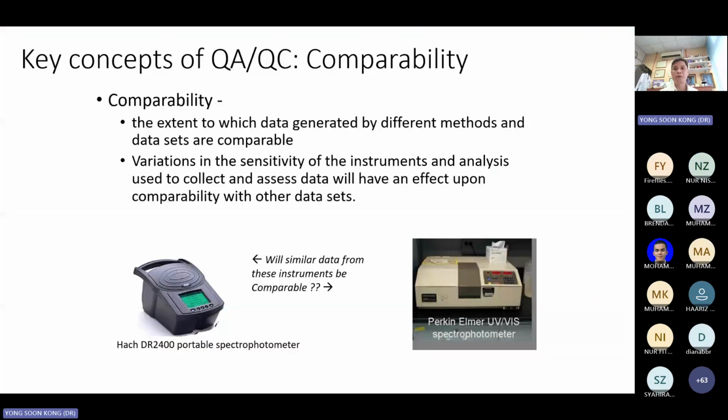Now I come back to our original slide, which is the comparability. Okay, so coming back to the same thing, equipment. Why are we concerned about comparability is that logically lah, some equipment are better. They are better and more accurate. Itulah persoalan dia. Is our multi-parameter probe sama accurate ataupun cukup accurate that our data can be compared with DOE punya data?